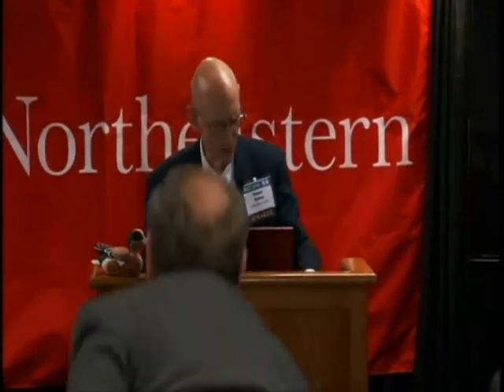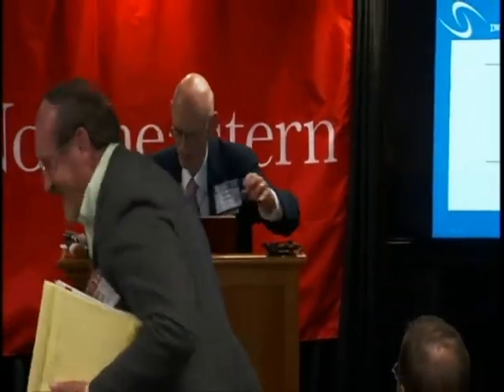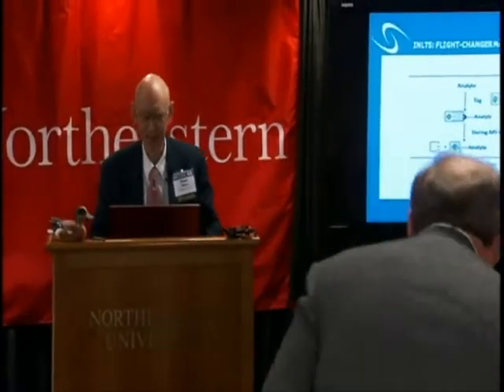Okay, so there's the neutral loss that falls off, and it continues on its way. So that's the second prop here. No more props.